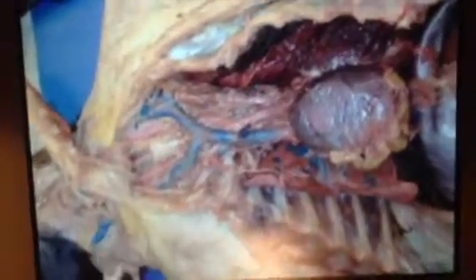Okay, now the abdominal cavity. We have our liver. And we have 4 lobes of the liver. Right? The liver has 4 lobes. So we have, this is the right and the left, and then medial and lateral. And then this right here. It's our gallbladder.